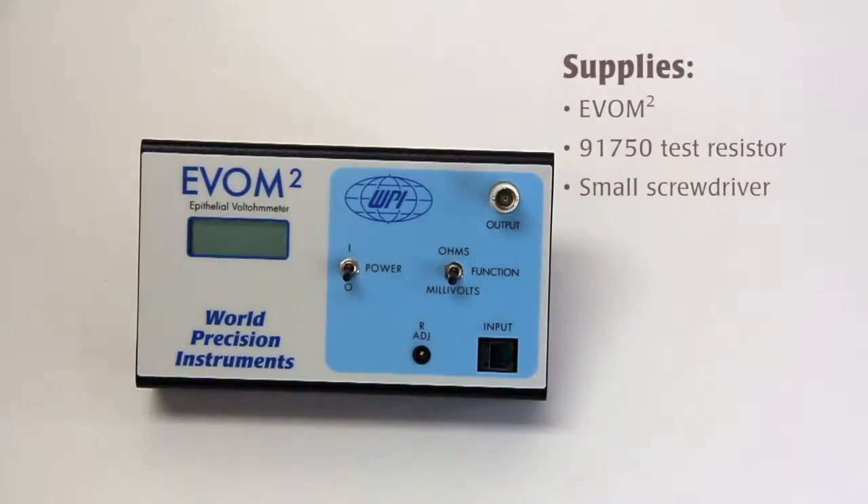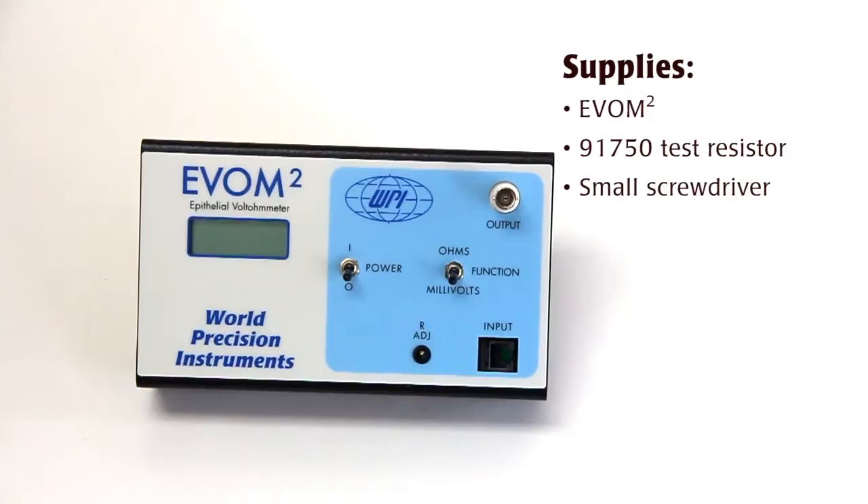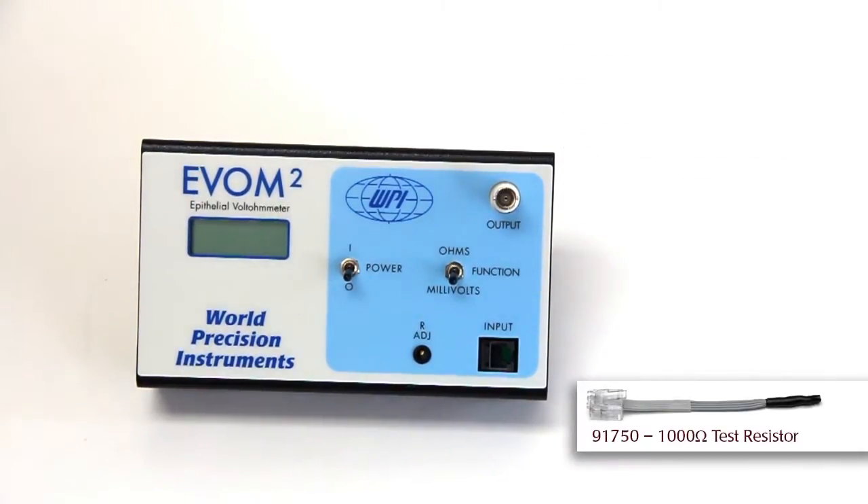Hi, I'm Mike Pisa with WPI Technical Support and here's another WPI technique. Before you use the EVOM 2, it needs to be calibrated to the 1000 ohm test resistor that we have. It's used for testing and it's also used for calibration.